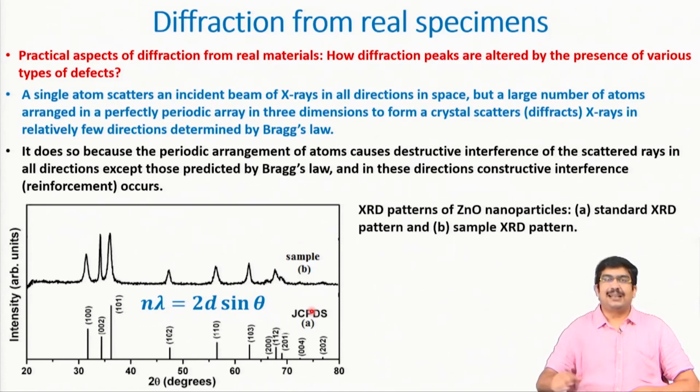But basically, this X-ray diffraction profile you yourself can generate. What you get from the database is actually a real specimen, again a real specimen under idealized conditions, a real specimen which you try to match with your specimen, but you can generate this one. How can you generate this?